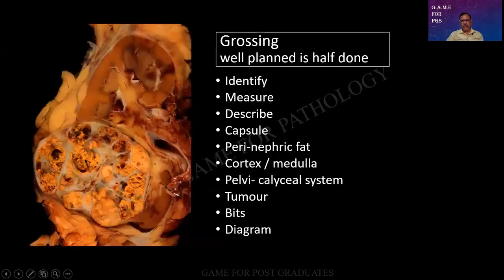Look at this one, a superb picture again taken from the net. The yellowish color that I had been telling you people, there are areas of hemorrhage. It appears well circumscribed, but sometimes we can be having small nodules outside, which are called satellite nodules. So seemingly circumscribed, but not benign.